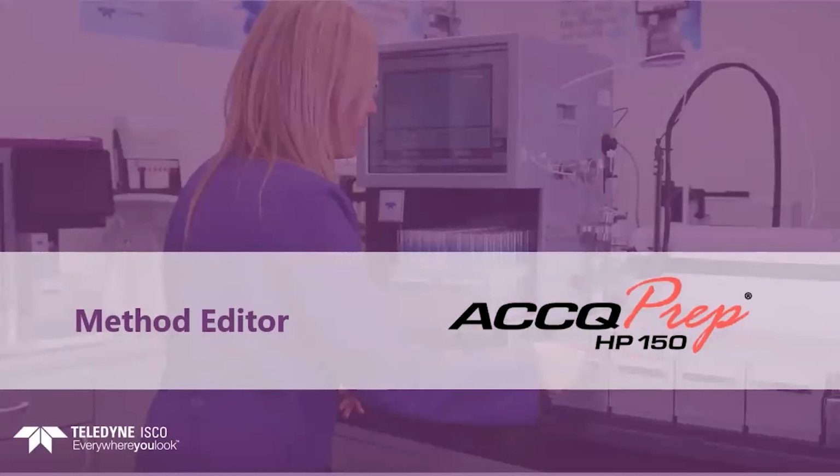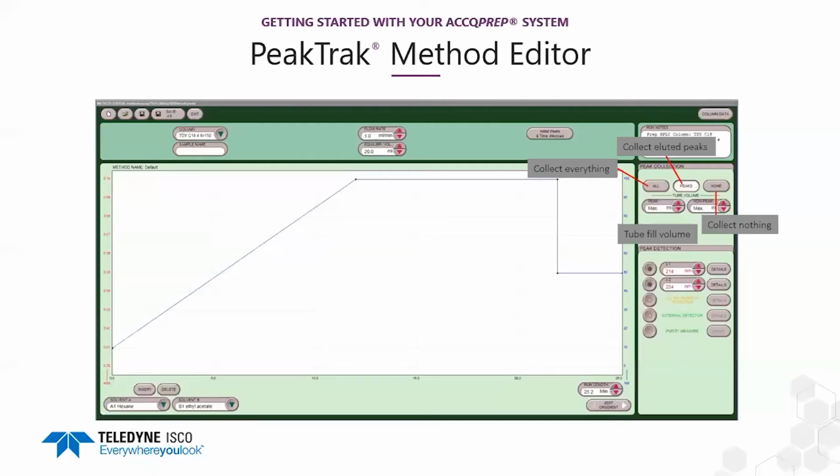We will discuss some of the other controls that you can use on the system. Some of these controls are duplicated on the main screen. For example, the sample name can be entered here or on the main screen. Likewise, peak collections such as collect all, collect peaks, or collect none are duplicated on the main screen.